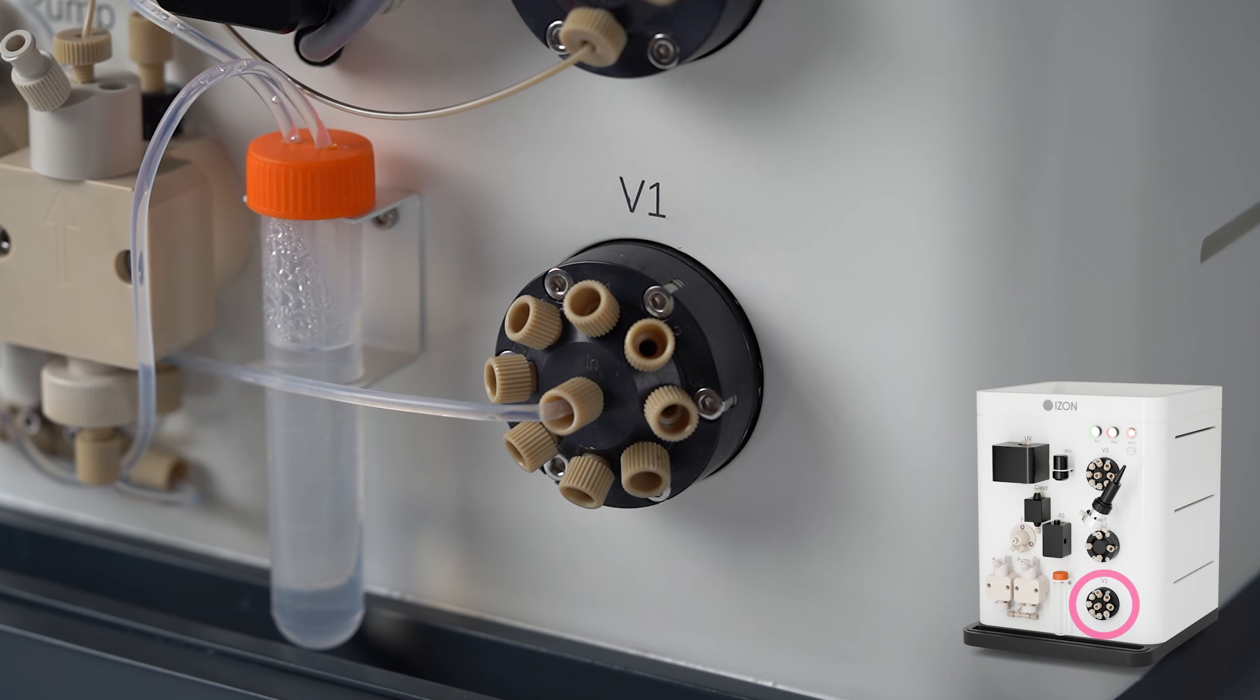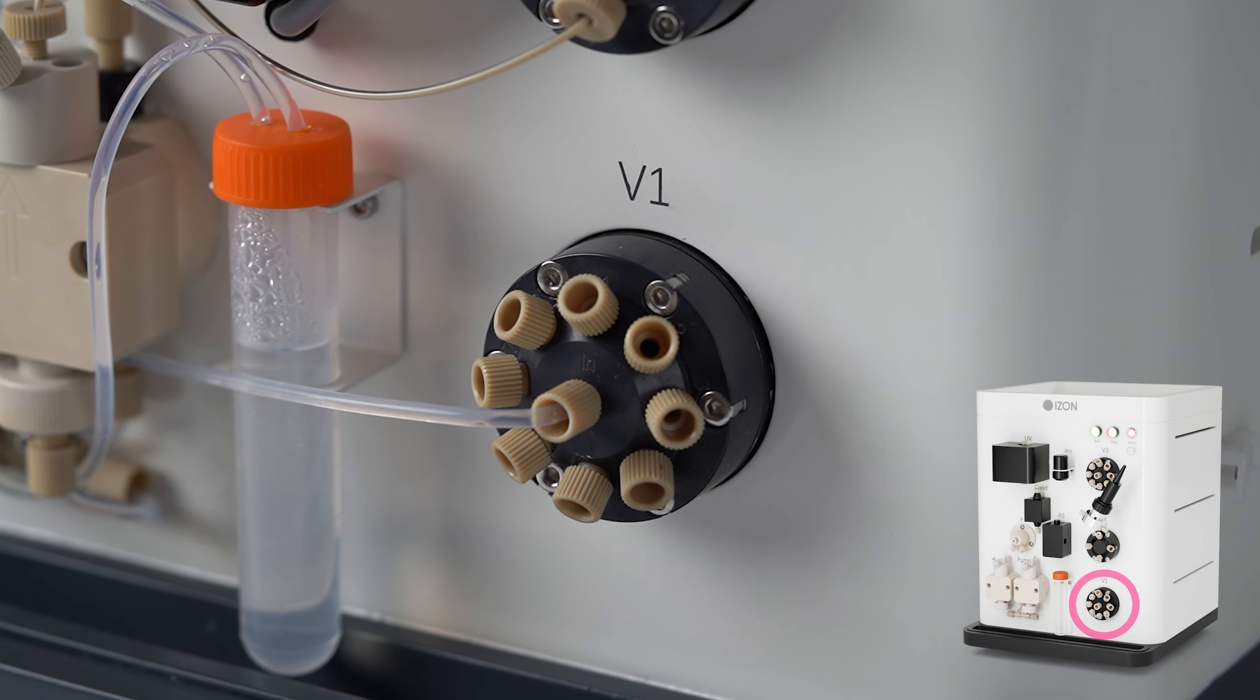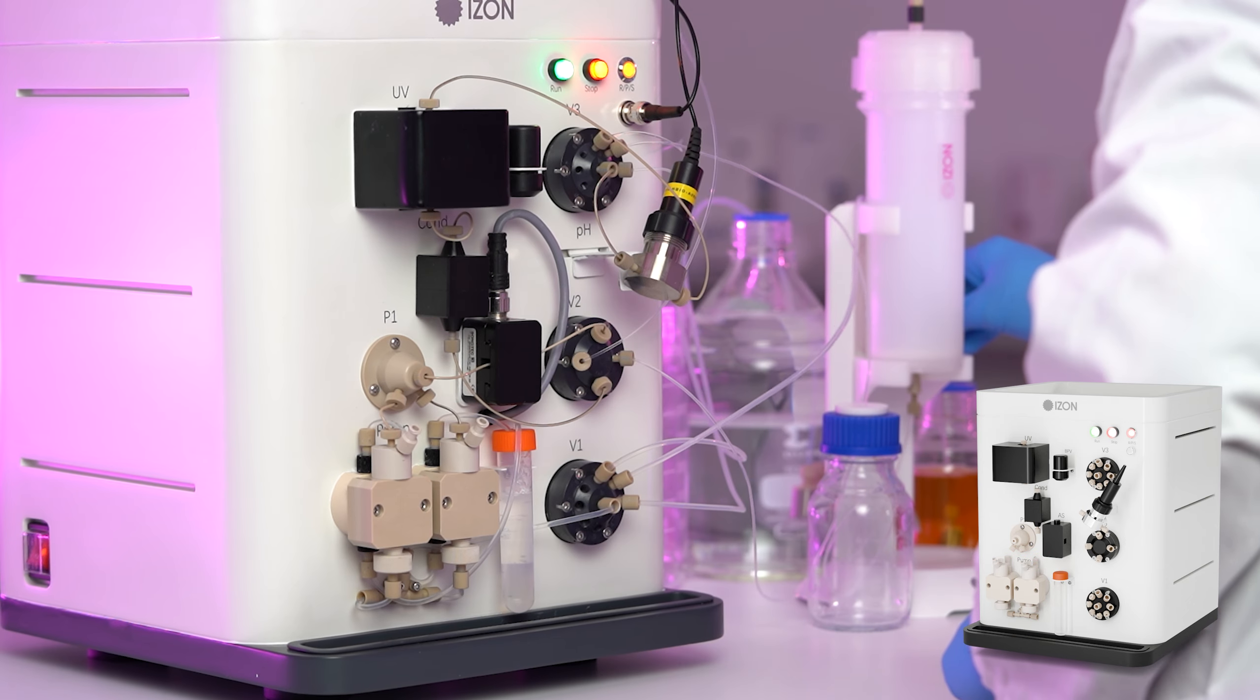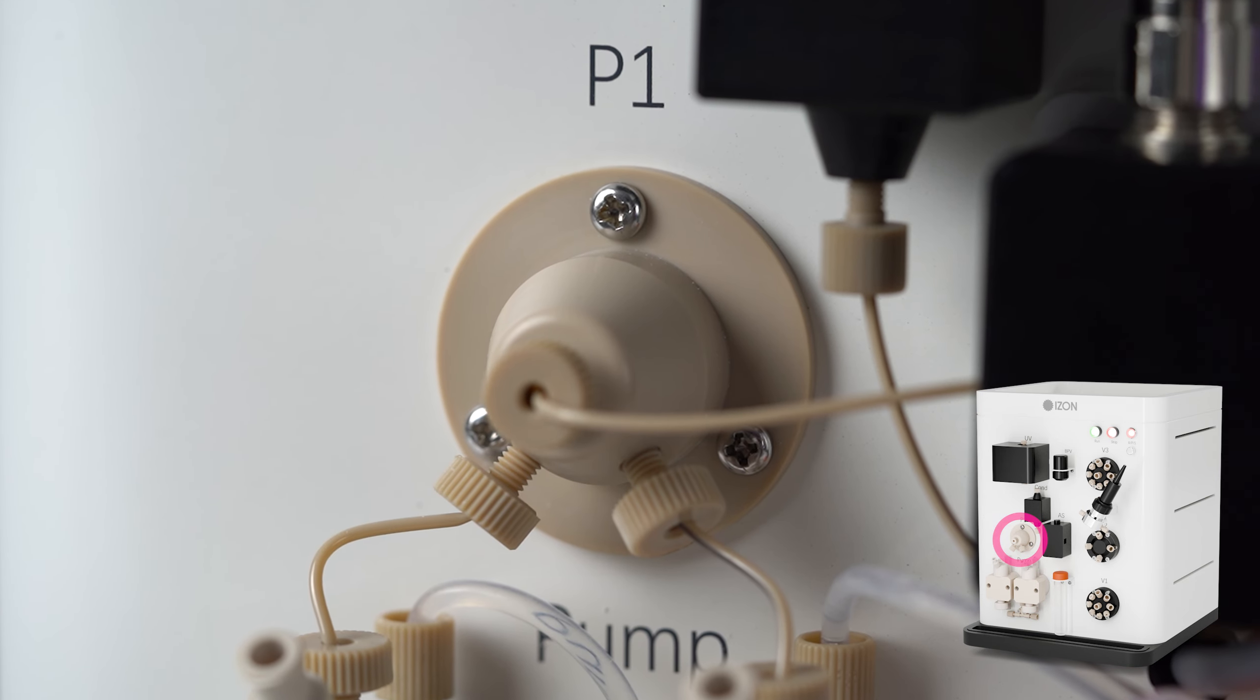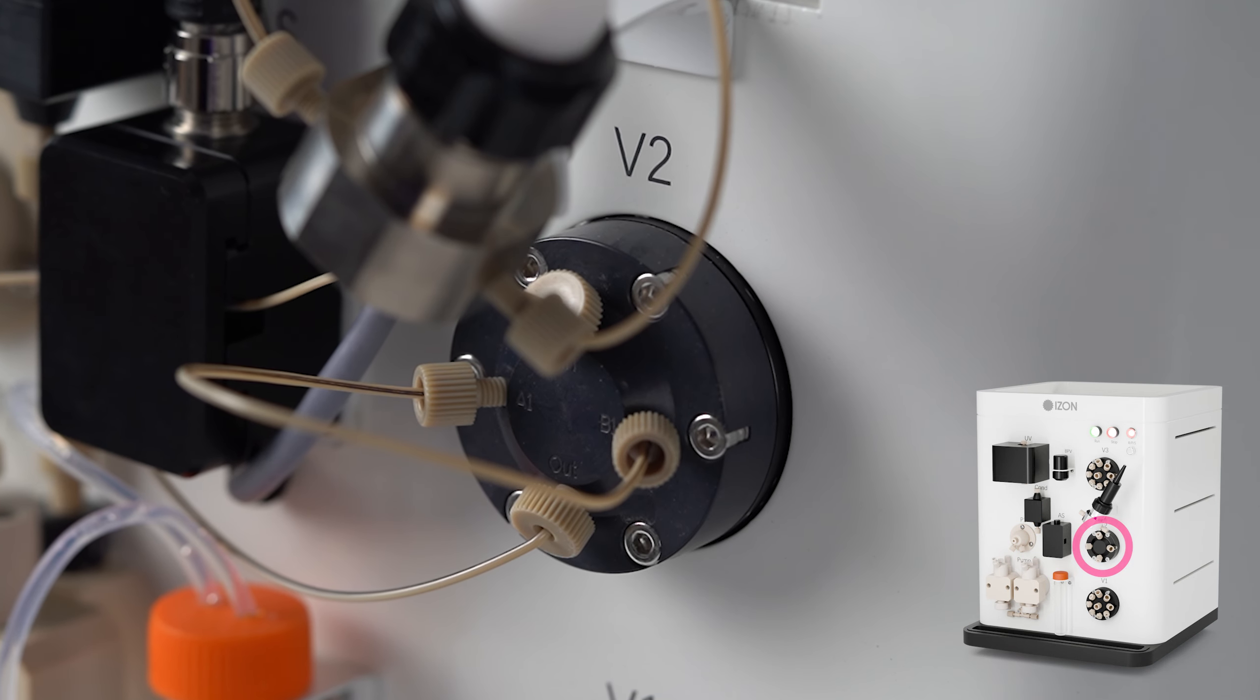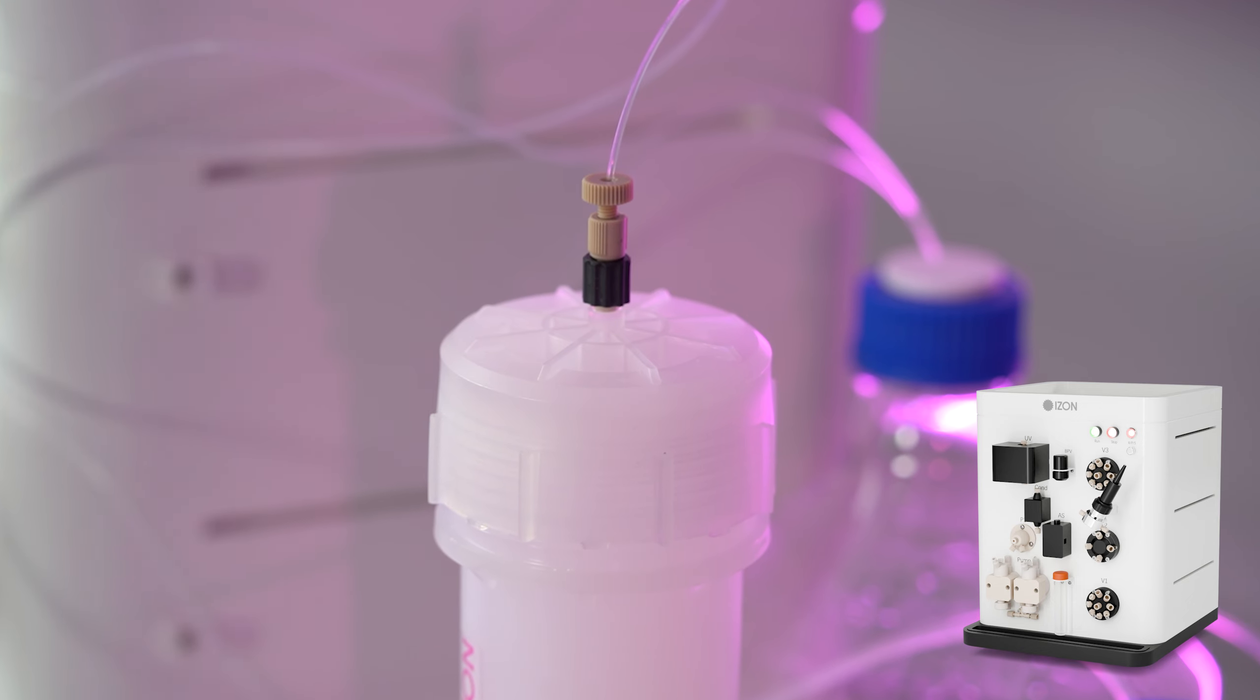The first valve controls which inlet draws liquid into the QEV Zinco, powered by an upstream pump. The liquid then flows through two key components: a pressure sensor and an air detector. The second valve then directs the flow through the QEV column in standard forward mode.